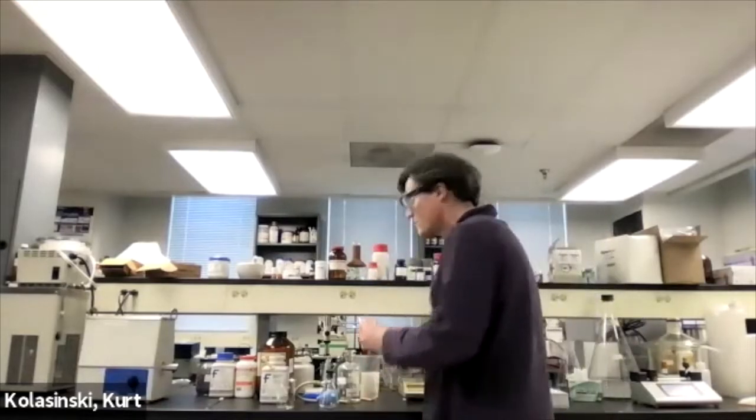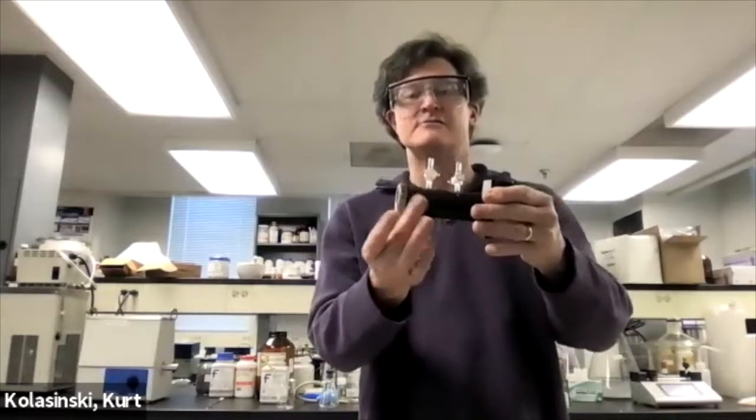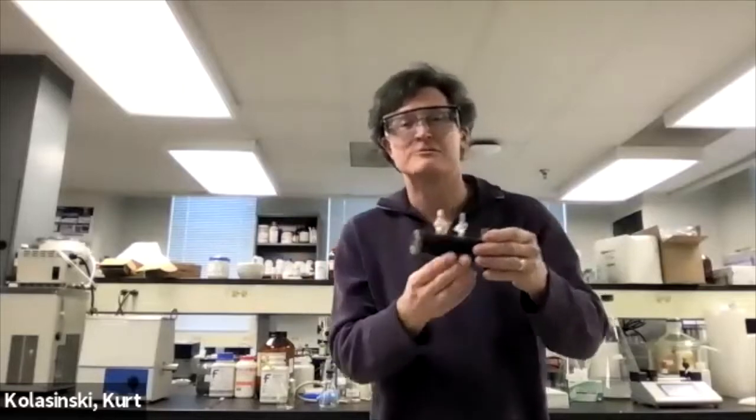Well, we're going to hold it in a cell that looks like this. This is the gas cell. It's nice and long, right? There's only so much pressure we can get in here. It's just going to be atmospheric pressure. But to get more molecules that can absorb, we're going to have a long path length, right? So gas cells tend to be long, because liquid cells are a cuvette, you know what they look like, but a gas cell is often a longer path length, so you can get more absorption, okay?